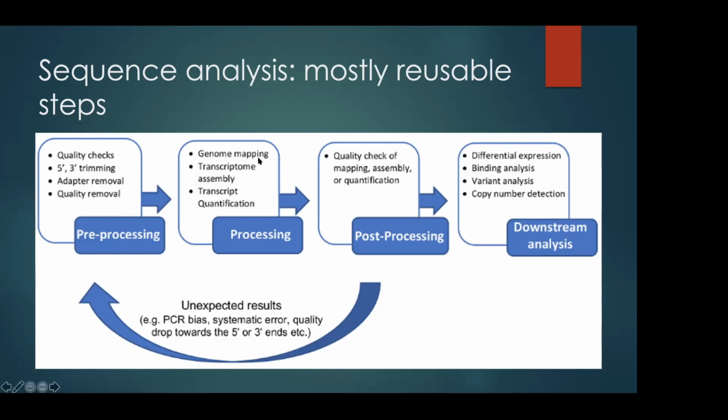But what I'm saying is when you map them to the whole genome, you can go to IGV and look manually to see if there's something interesting. And you can use other tools like Cufflinks or transcriptome assembly software like StringTie. StringTie is going to use your own reads to assemble the transcriptome. So you can use that transcriptome to quantify again.